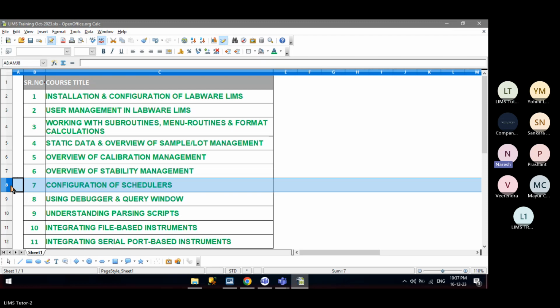Yeah, I have one suggestion from you. Basically, I worked in quality control. For the last 4 years, I'm using the Caliber LIMS. So I was involved in all the admin activities and master activities, and all those resource activities also. So I'm aware of all the things. So next step, what can I choose, like administrative or IT side in the LIMS?